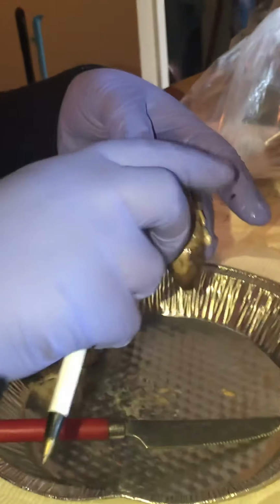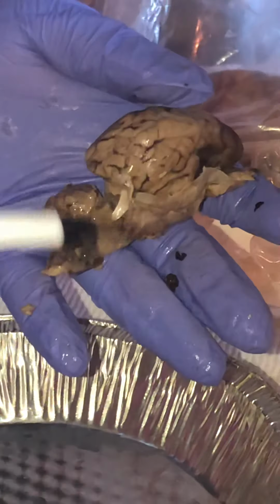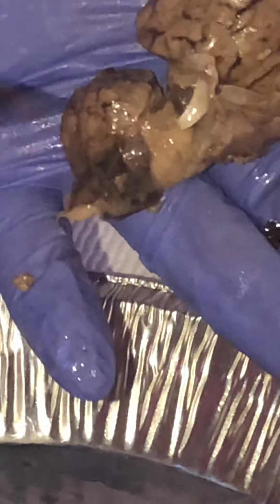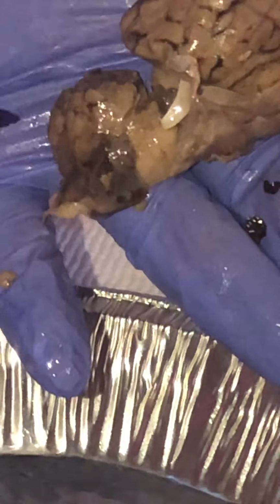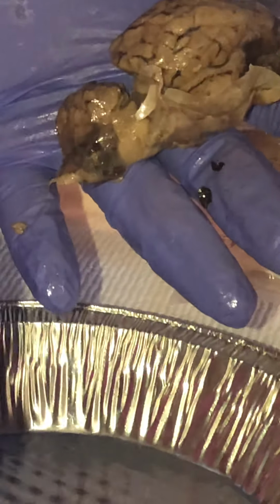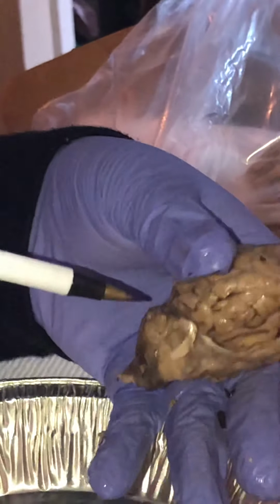Then we have the transverse fissure, which goes left to right, which separates the front and the back. I'm so nervous. Okay, I'm running out of time.